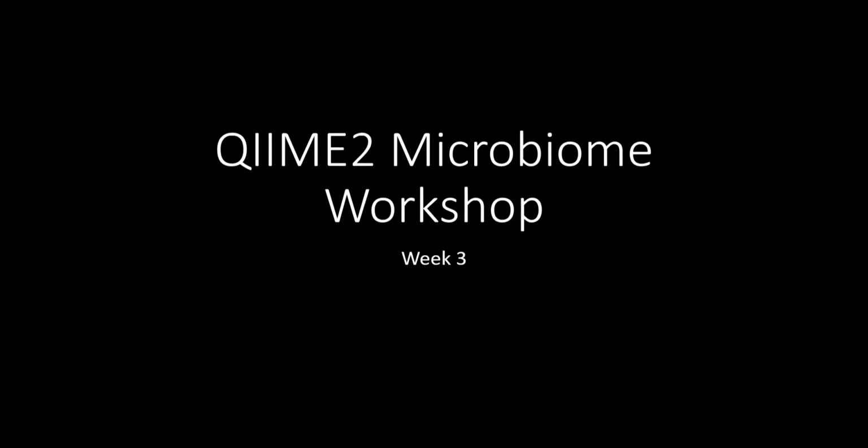I'd recorded this in our Zoom call last week, but unfortunately the audio didn't capture. I could hear everybody else's input, but I couldn't hear myself in the video, so I'm just going to re-record it fairly quickly so that you guys have access to this. So this is week 3.